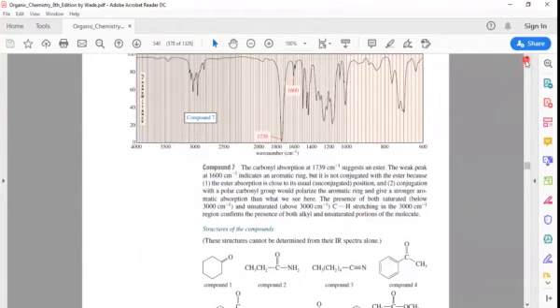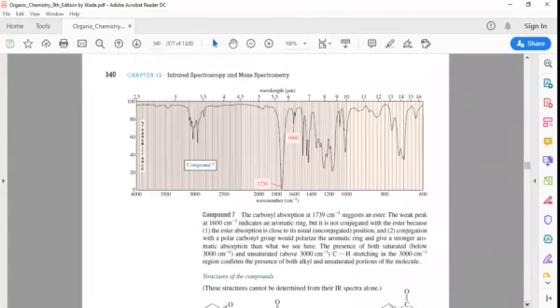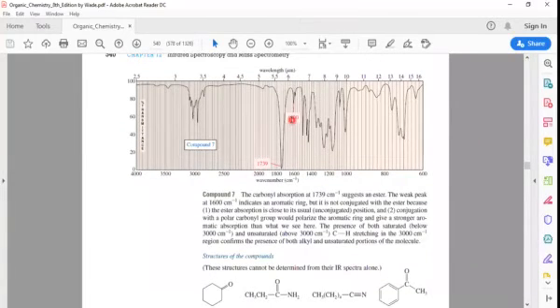This compound is very important and interesting. You have this carbonyl at this peak, and if you remember, this is a somewhat higher value. We also do not have those characteristic peaks of an aldehyde, and no hydroxyl group, so it is most probably an ester.